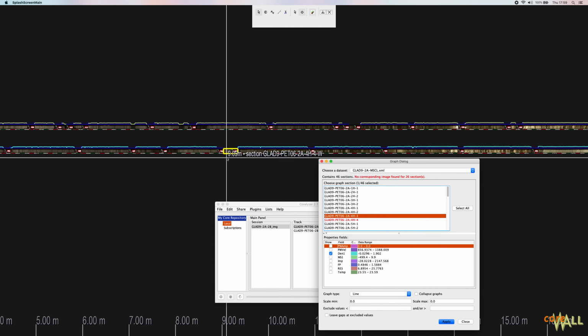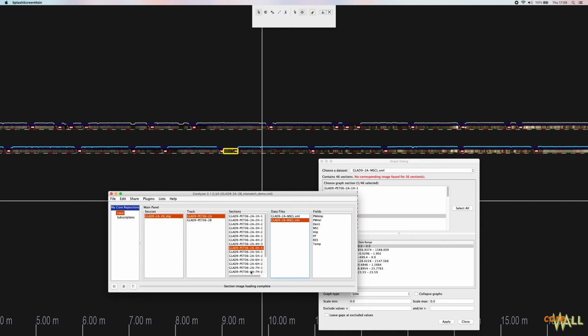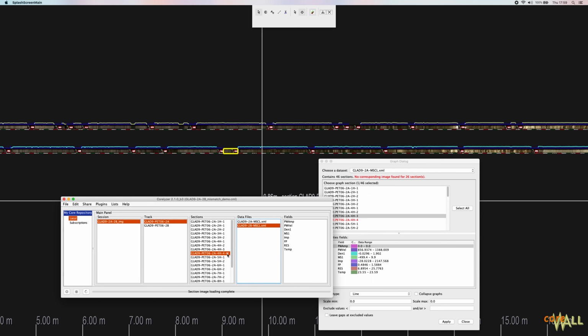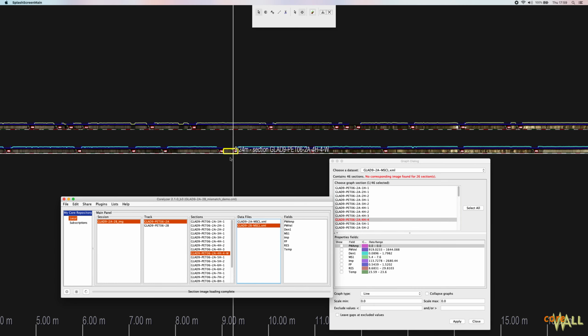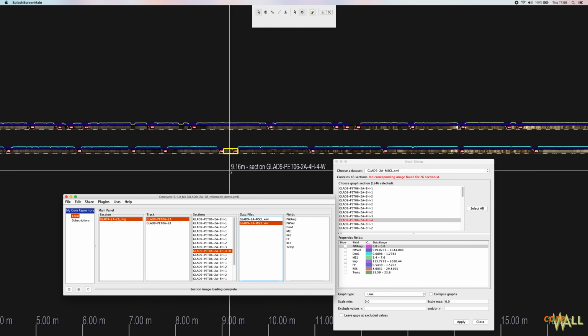You may have already guessed, the problem is that this core section, and this is a very common problem, has a W appended to it because it is the working half, and somehow that extra W snuck in there, whereas it didn't for any of the other images. They don't have an A or a W at the end, but this one did. Because of that W, it doesn't perfectly match 4H4, because it's 4H4W, so data can't be plotted on that section. That is why that's not happening.